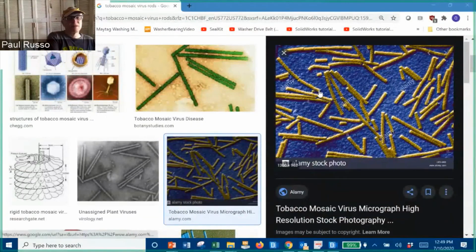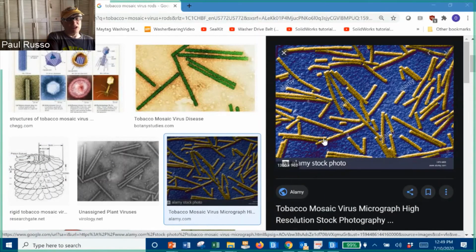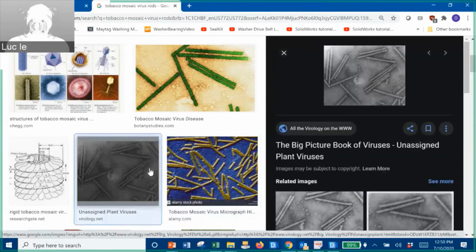Yep, I see beautiful rods. Yeah, and you see they tend to break. That's the downside to TMV as a model rodlike polymer, that it breaks a lot. And it has a particular defect at about 2/3 down the rod. It breaks. So you probably have a bimodal distribution here. This guy, you can see where I'm pointing my arrow. That's probably an intact one. And you see a lot of these little sort of stubby ones like that one and that one and that one. But there's a characteristic breaking pattern. But there'll be lots more. Look at this one. Here's some more.